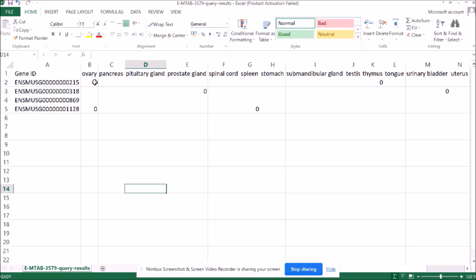We will change it to 0, and all the genes whose expression is 1 or more than 1 we will change the value to 1, because at the end of the day, 1 or more than 1 is the same in terms of expression, because we consider them being expressed and we want to see in how many tissues a gene is being expressed. So we have to do a little bit of filtering of the data just for the calculation purpose.